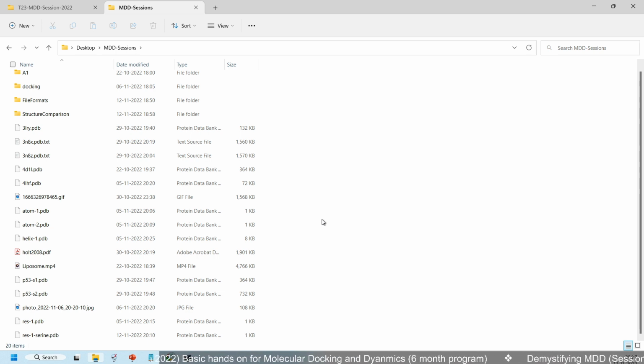Yes, sir. Okay, so the first thing is that you are able to select the ligand using the Lig residue or unknown residue, or just by identifying it through a selection command.